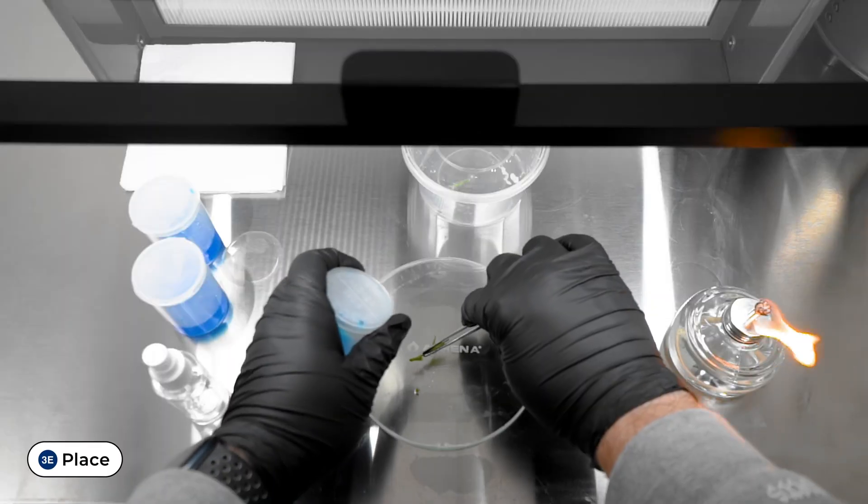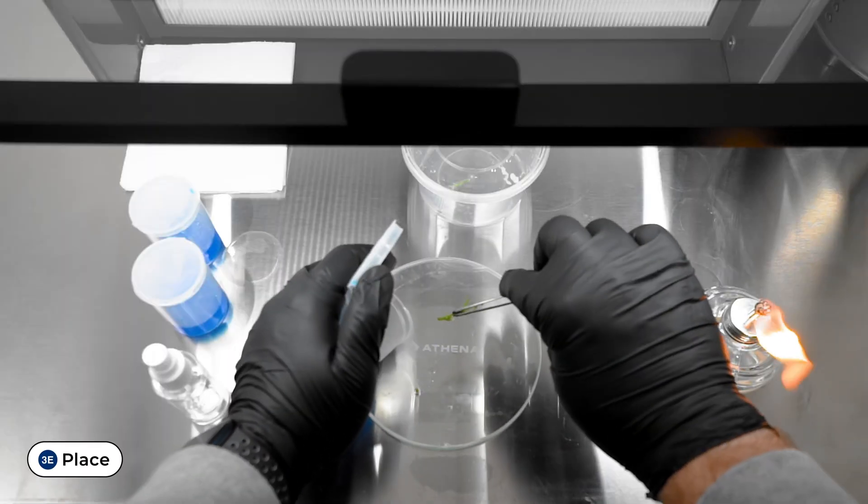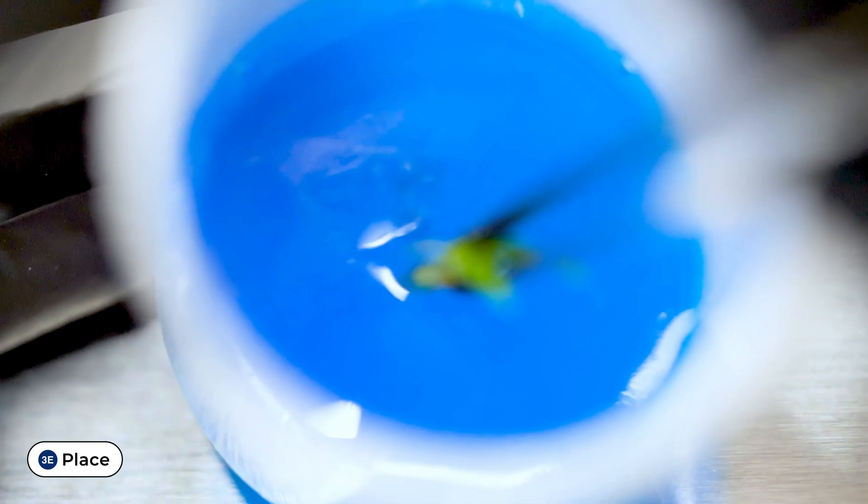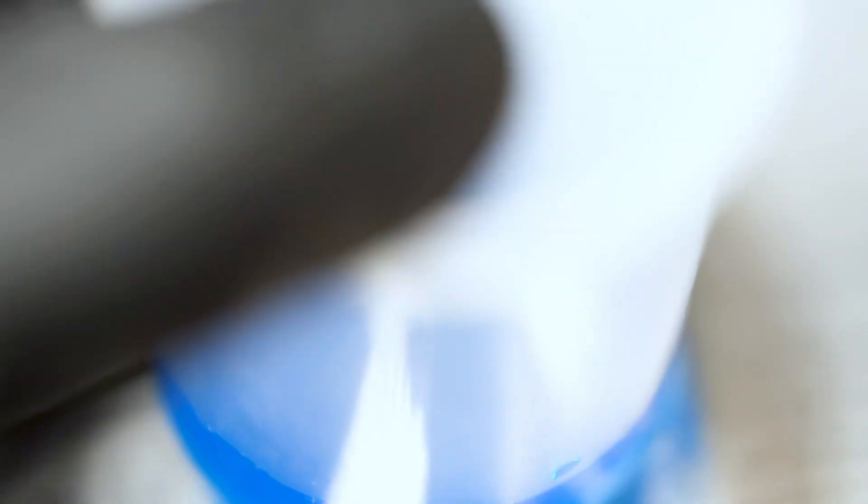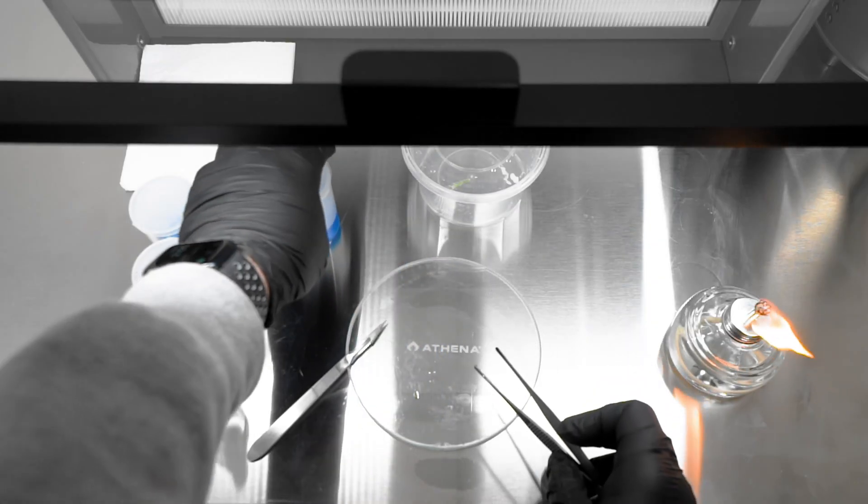Slightly open a culture vessel and place the node's exposed tissue into the media, ensuring that the tools do not touch the media or culture vessels. Close the cap right away. This is now an explant.